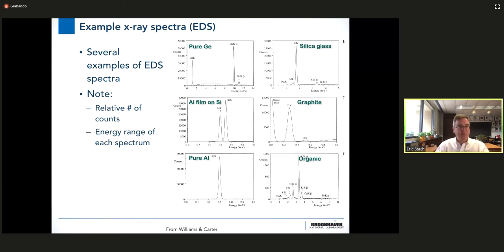So just like with X-ray fluorescence spectroscopy at beamlines, we stick a detector in, we see these sorts of events, and we're happy to be able to characterize the chemistry of the sample. I'll show some examples of this. If you think about this in the case of beamlines, we're generally bringing in a beam, and we may focus it. We learned about focusing to do fluorescence mapping. That's done at the SRX, XFM, and HXN beamlines at NSLS2. We can do the same thing with an electron microscope.